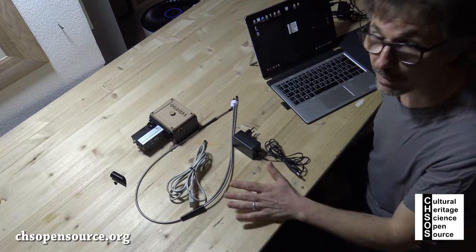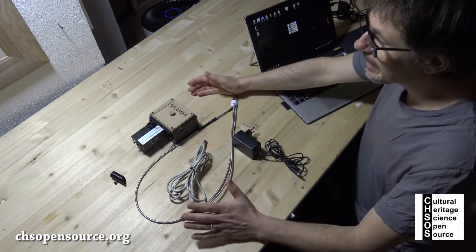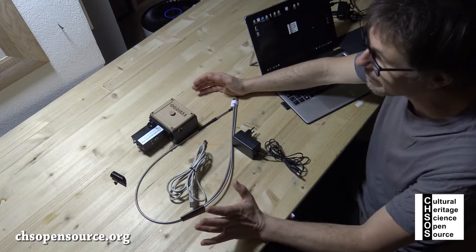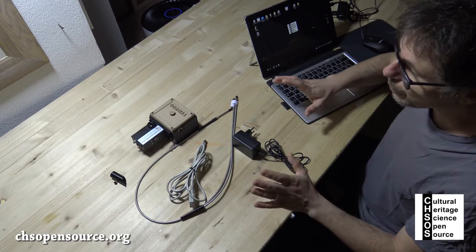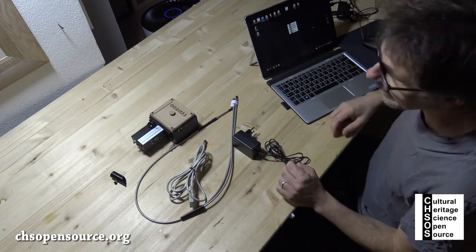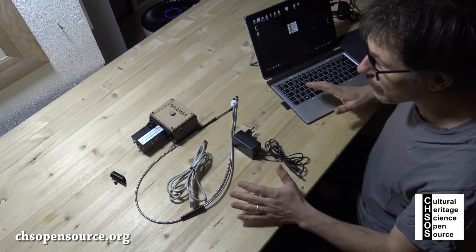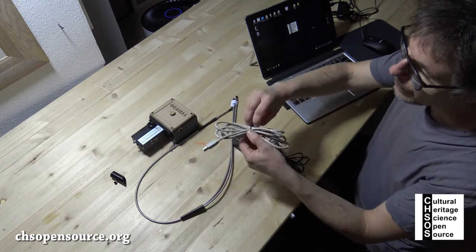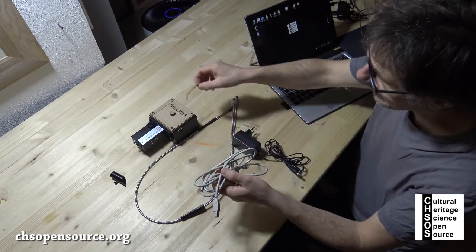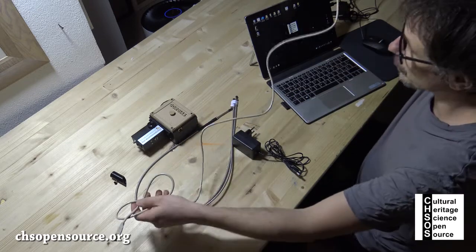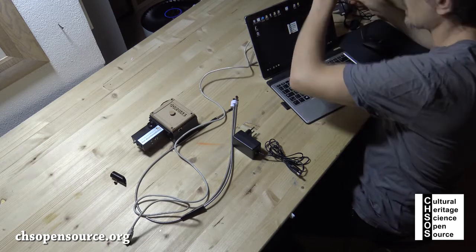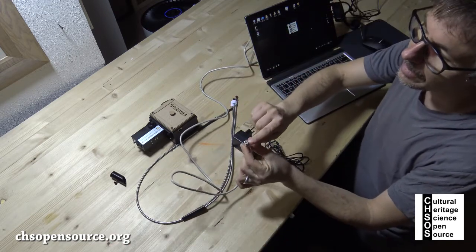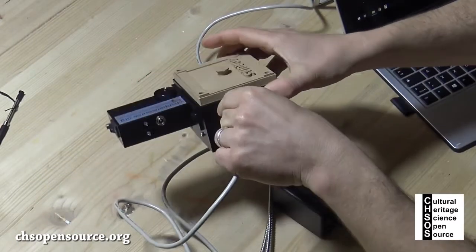Thank you for purchasing Gorgias. These are the main components of the system you just received. Let's start to prepare the system for acquisition and then we are going to see how to use the software. This is a USB printer cable. The USB goes into your laptop and the printer port goes into the spectrometer.